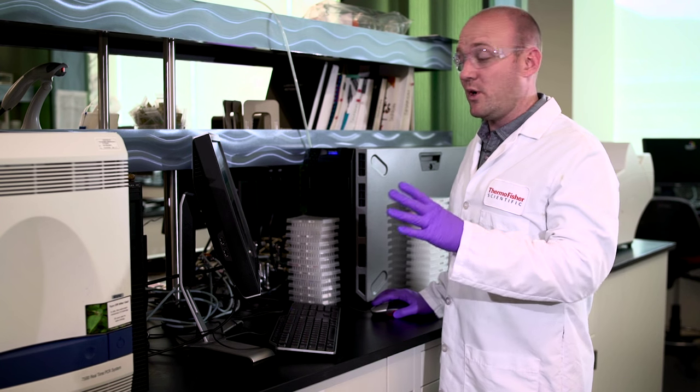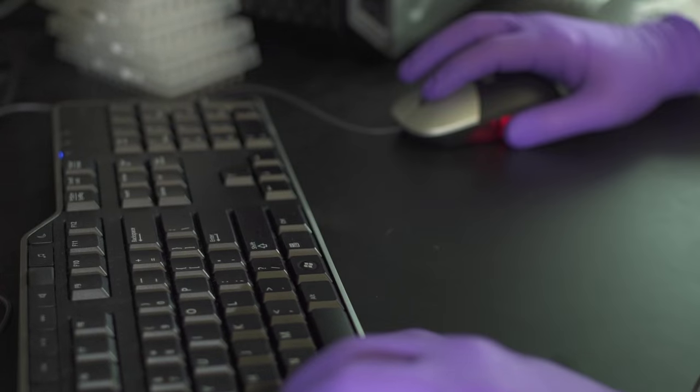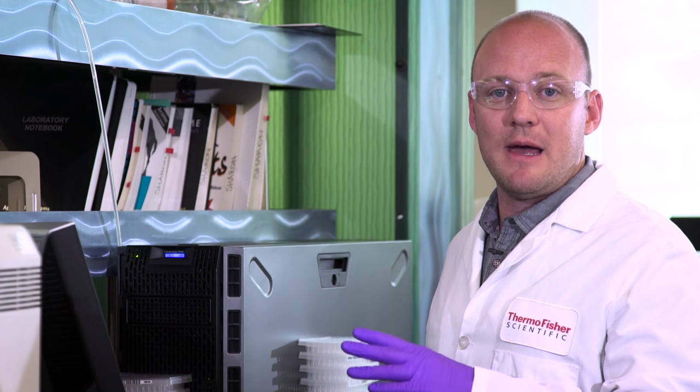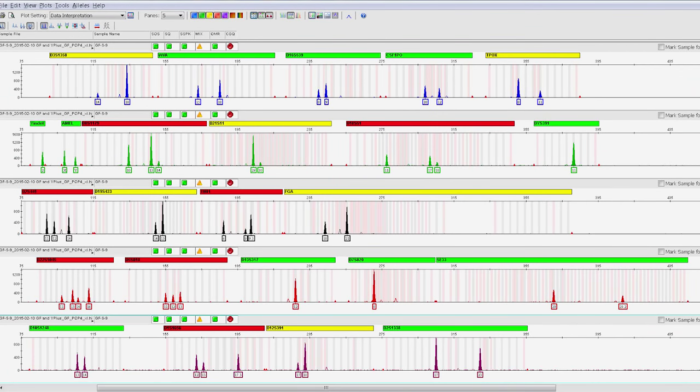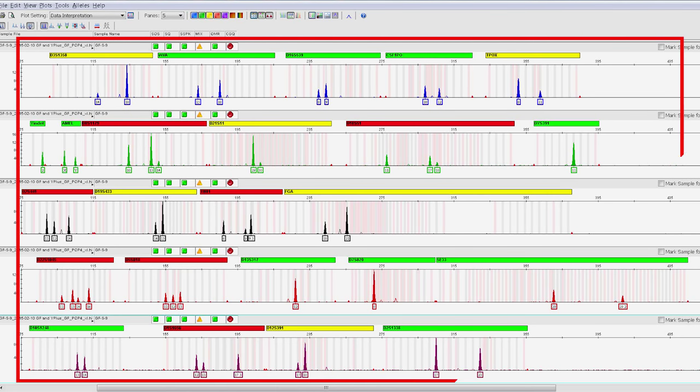This is where the GlobalFiler Kit can really help. Looking at the profile in GeneMapper IDX, with just the initial male concentration of 6 picograms per microliter of DNA, which allowed for an amplification of 90 picograms of DNA, you can see here that we were able to still obtain a strong male profile.